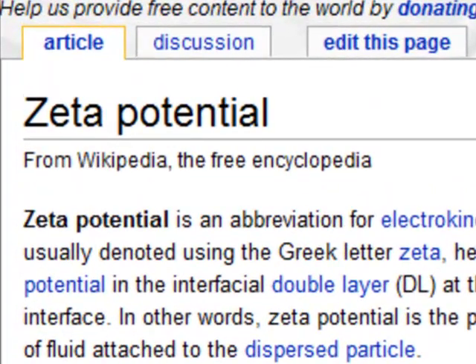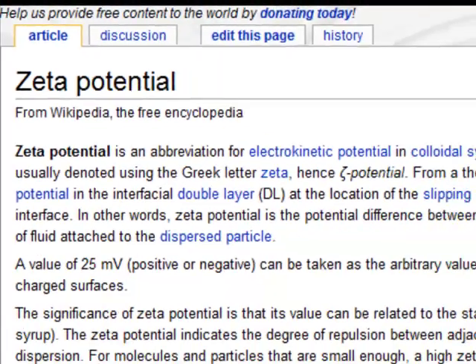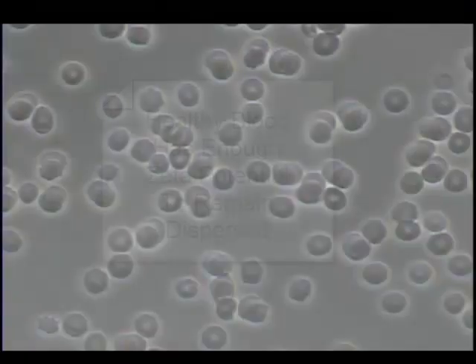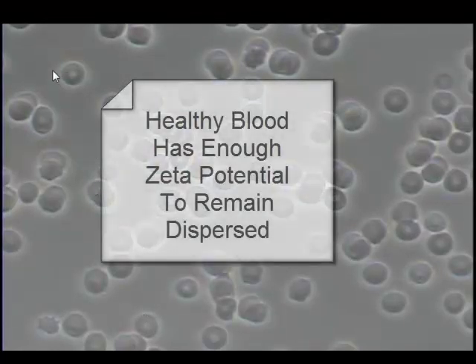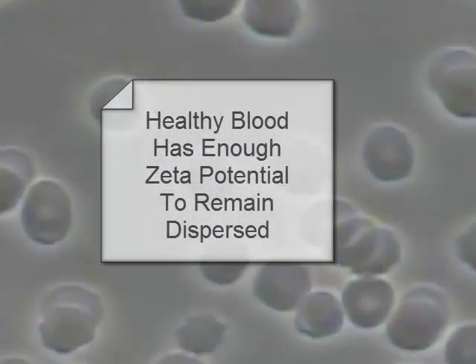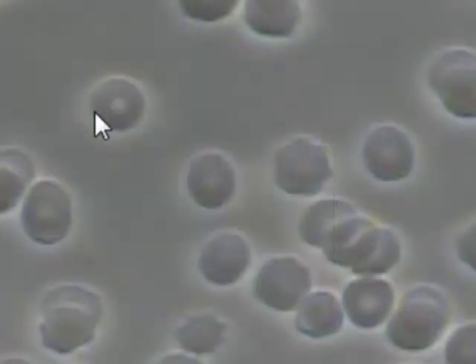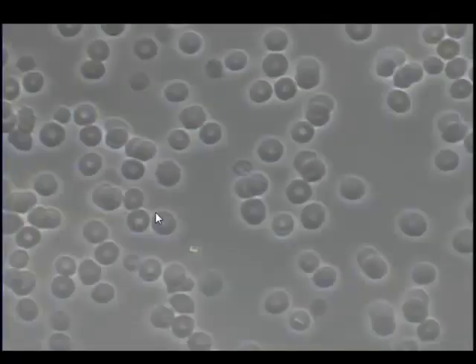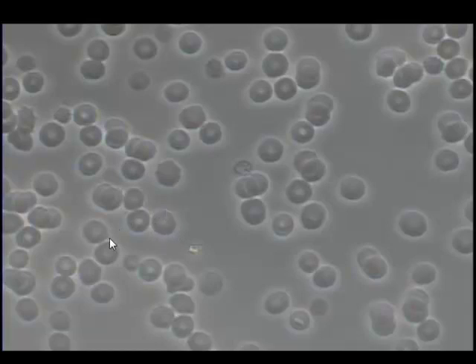Zeta potential is the property of particles in a fluid to remain dispersed or separated. This image illustrates a sample which has a reasonably good zeta potential. Most of the erythrocytes are separated and have a good charge distribution or halo around them, indicating that there is sufficient electrostatic repulsion to maintain separation.